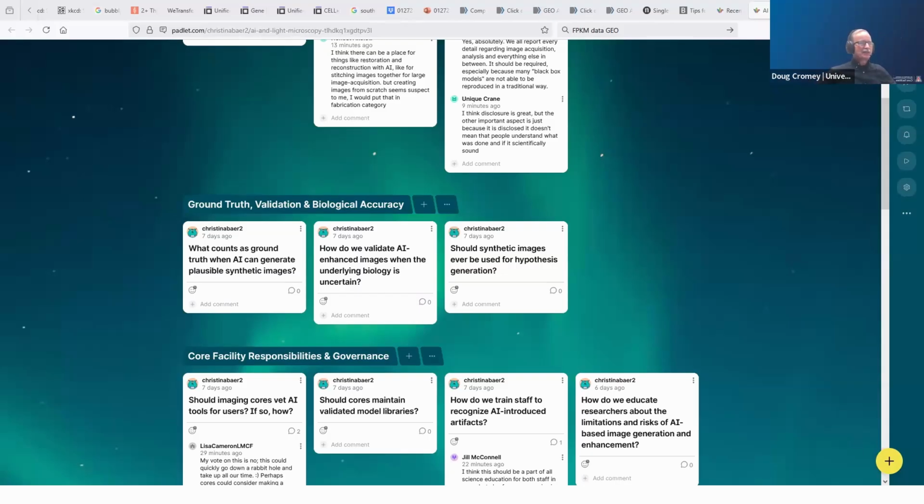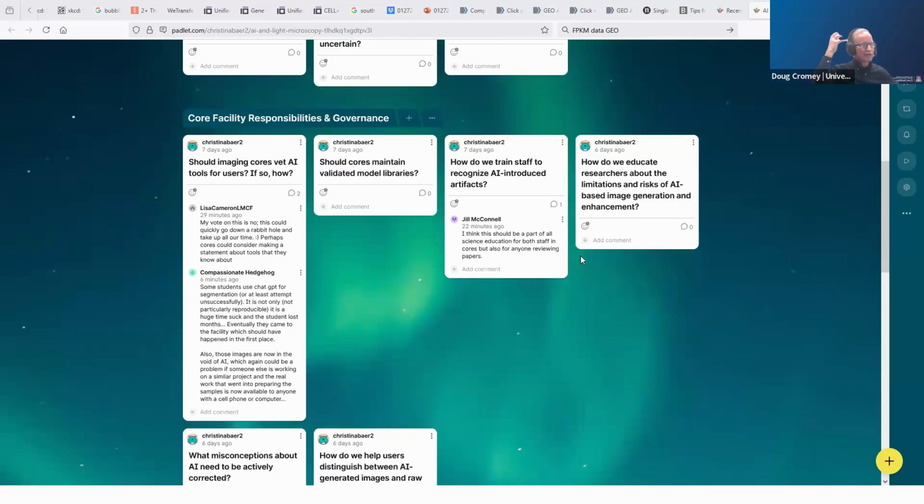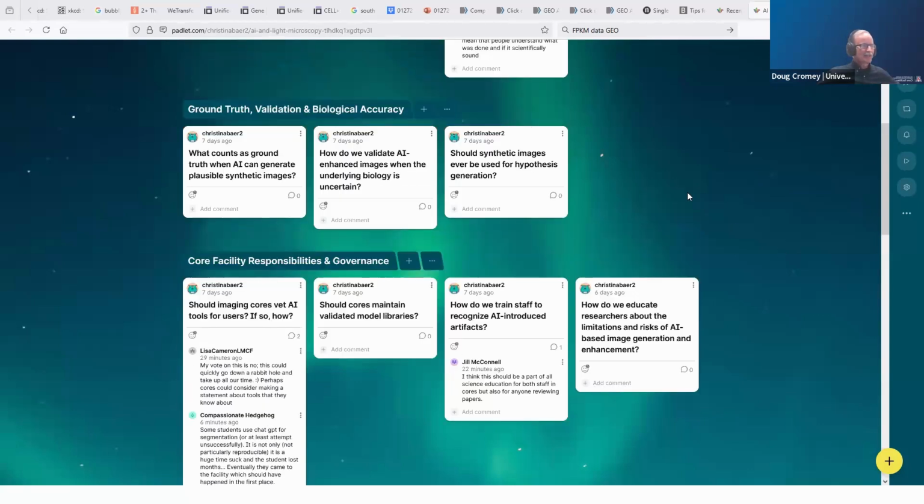I recently was talking with someone about their samples and different ways of doing sample prep. I started out as an electron microscope guy, so fixation is always in the back of my mind. And if somebody's doing things on, like some of the research is doing artificial H&Es on a transmitted light section, what happens if a different histotech cuts the sections?